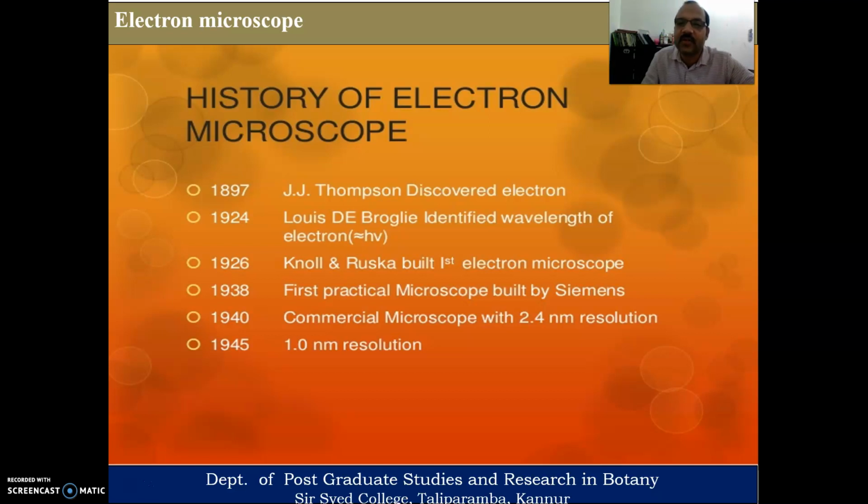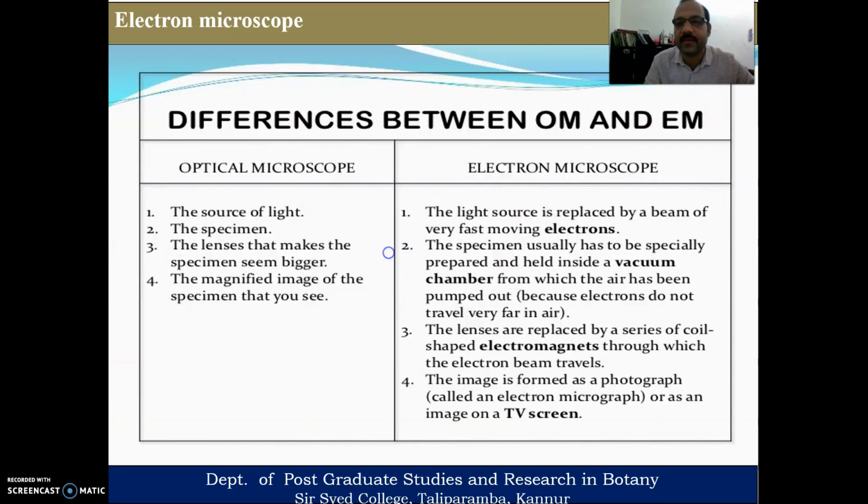So these are actually the most important historical events behind electron microscopy. See, what are the important differences between the electron microscope and the optical microscope?